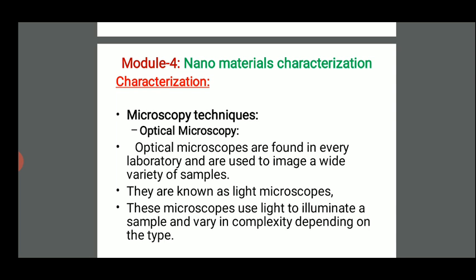Then the first of the kind in the microscopy techniques is optical microscopy.